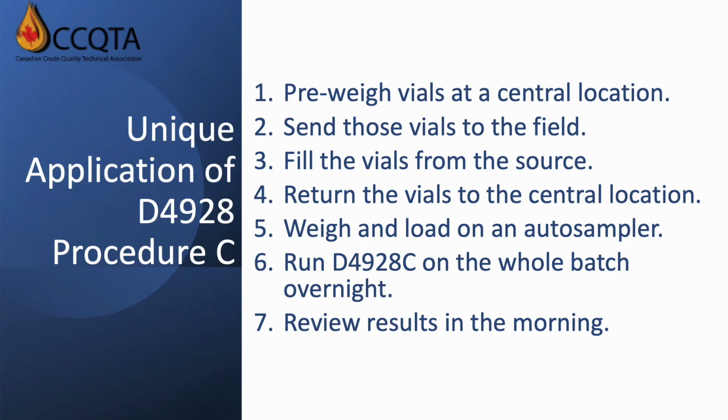What this process flow also allows is centralizing instrumentation, calibration, and QC, which leads to better data. A wider adoption of this protocol in an area would allow multiple producers and midstream in an area to centralize testing and reduce disputes over water contents.